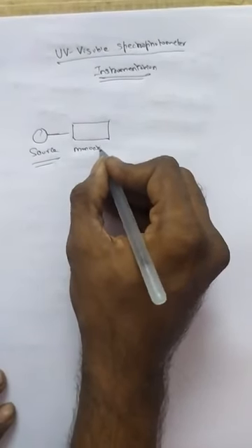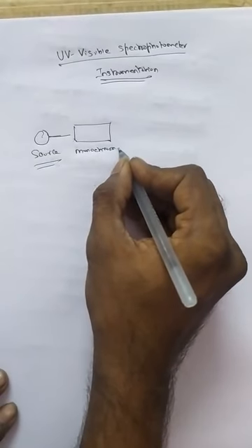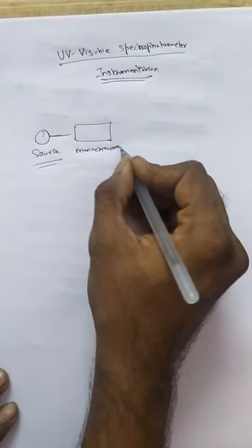A monochromator is nothing but a grating, a slit which allows only a particular wavelength. It allows only the energy of a particular wavelength to come out of the grating.